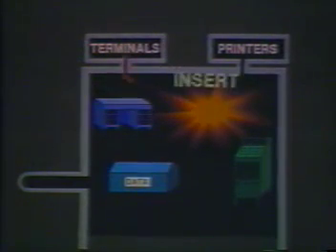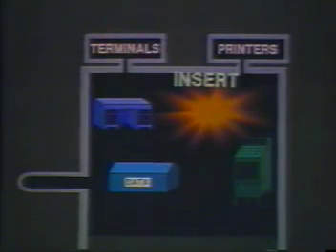Let's look inside the computer to see what the Magic Secretary does to help Tom prepare his protocol. To catch the secretary's attention, Tom presses a special key on his terminal that is labeled Insert. Insert is a generic command that is used whenever you want the secretary to insert a new drawer onto a desk or to insert new information into an existing drawer.